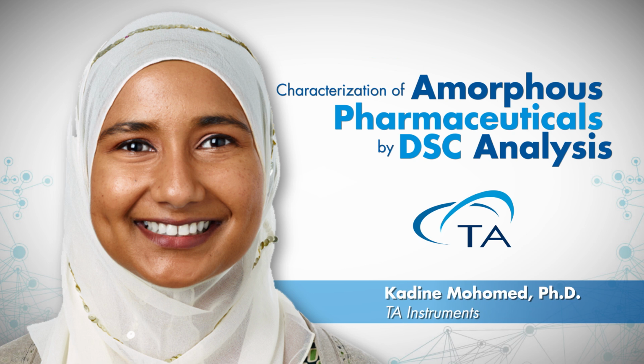With alumina versus aluminum, so a ceramic pan versus aluminum, which we would typically use for the DSC, you're looking at differences there in thermal conductivity. Alumina or ceramic is not as conductive as aluminum, so heat has to transfer from your sample through the DSC pan to the DSC sensor. So if your pan itself is not very conductive, you may lose some sensitivity in being able to see that transition as compared to aluminum or even materials such as gold or copper, but more so aluminum that is commonly used on the DSC, that has a very high thermal conductivity value, so the heat transfer path is optimized and you're not losing sensitivity in your measurement.